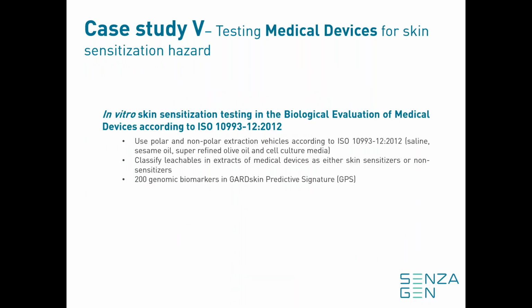So the next project that I would like to also briefly talk about is the GARD skin assay used for testing of medical devices. This is a very new assay that we now have available in our portfolio, and the testing is performed according to the ISO 10993 standard for evaluation of biological materials.